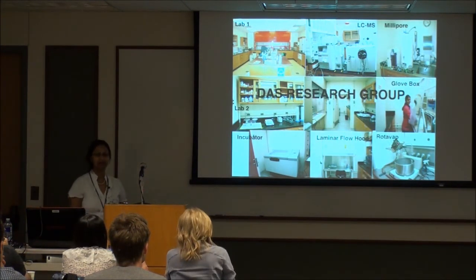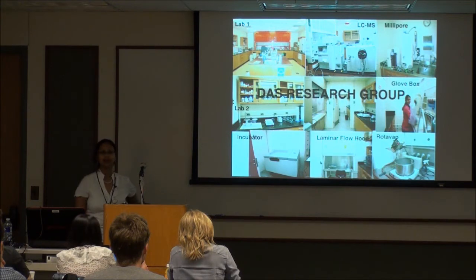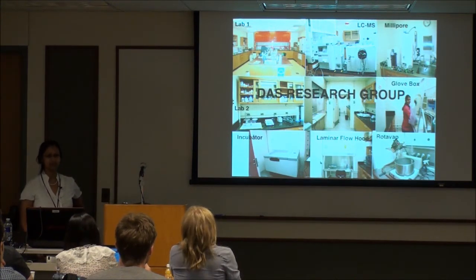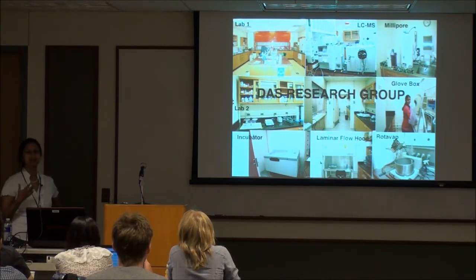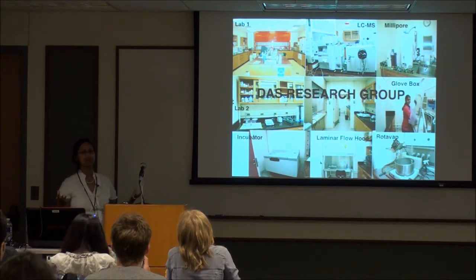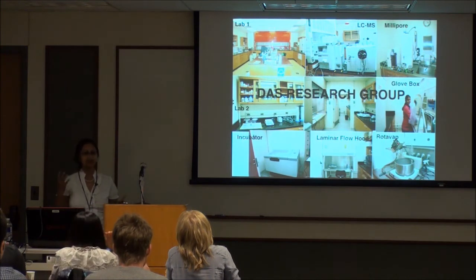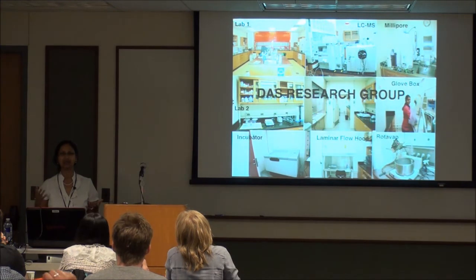We are a biochemistry lab, and you can see a lot of typical biochemistry instruments are here. We express proteins in E. coli, insect cells, and human cells, and then we take those proteins out. We put them in the structures called nanodiscs, which I'm going to describe today what those are. And then we study 2 things in the lab. First is we try to study the biochemistry of how this protein functions. So we are those people who study in detail about proteins' mechanism.